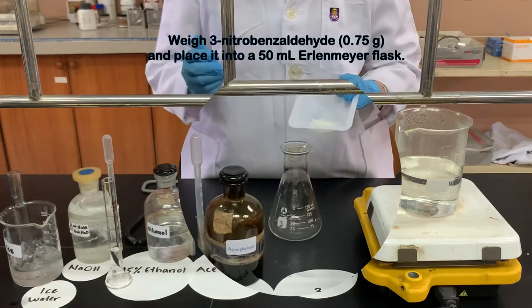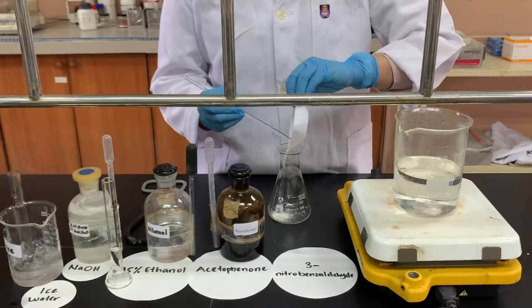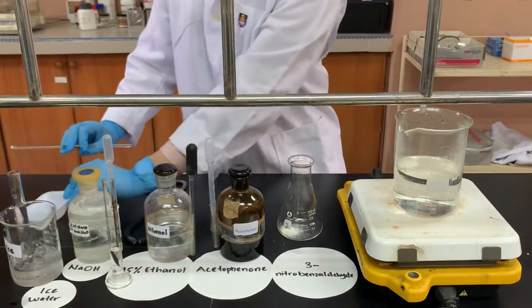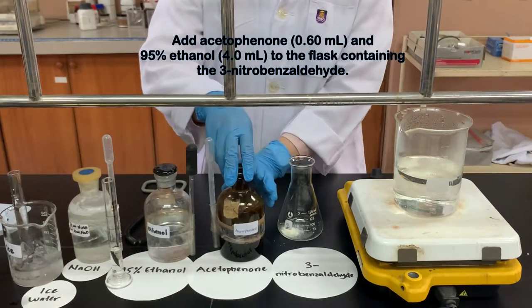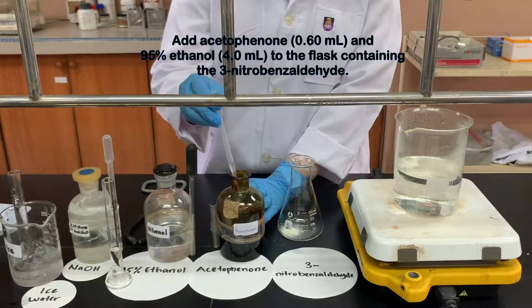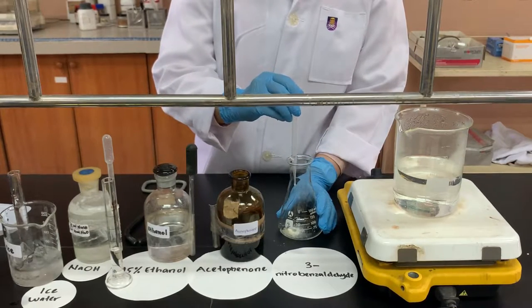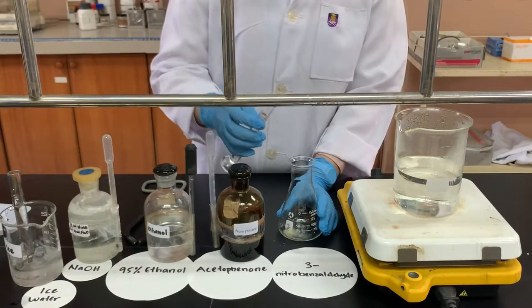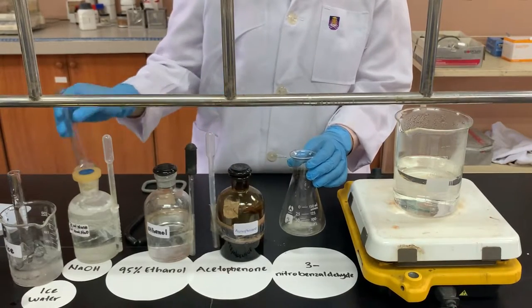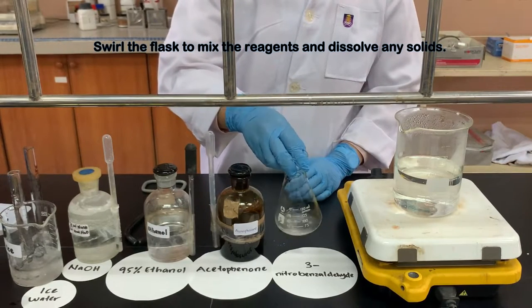Weigh 0.75 g 3-nitrobenzaldehyde and place it into a 50 ml Erlenmeyer flask. Add 0.6 ml acetophenone and 4 ml 95% ethanol to the flask containing the 3-nitrobenzaldehyde. Swirl the flask to mix the reagents and dissolve any solids.